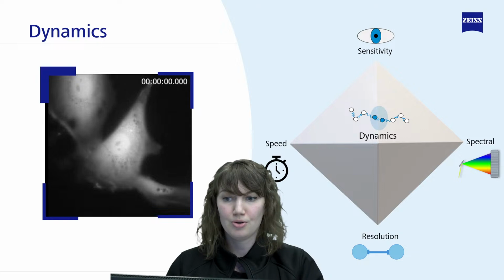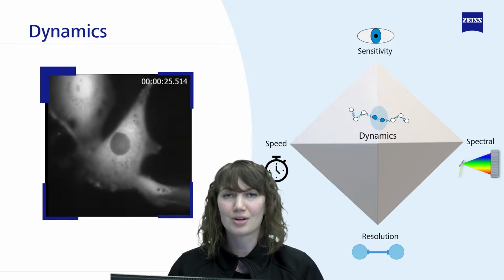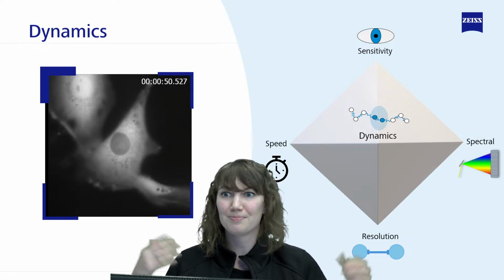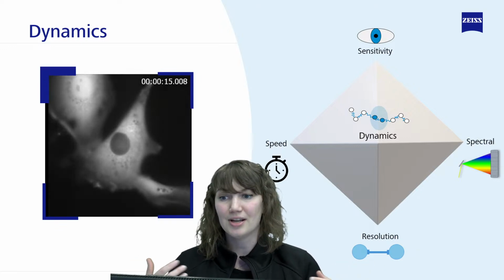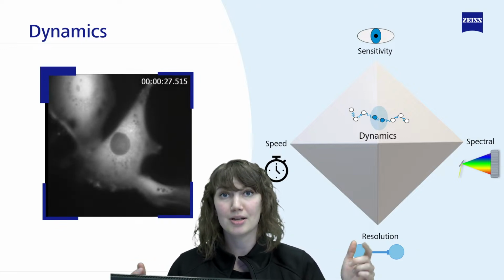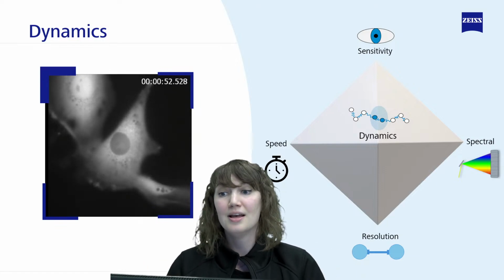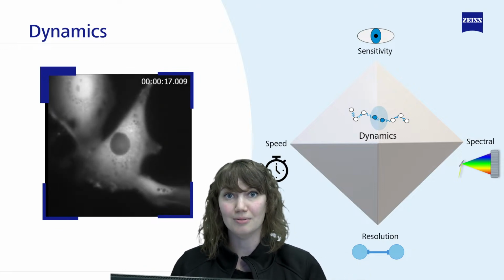So for anybody out there who is saying, well, I use FRAP. I use fluorescence recovery after photobleaching. It's a technique that's worked for me forever. Why should I change methods? A concern you might have, actually, is we're bleaching a cell and we're trying to then measure diffusion back into that cell of whatever our protein of interest is. And that's great and it works and it's well established, but we are introducing photo damage into that cell, right?